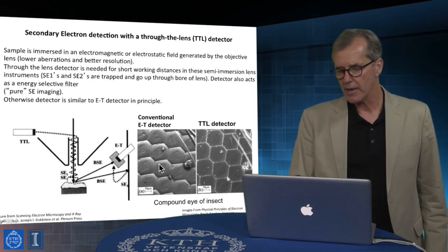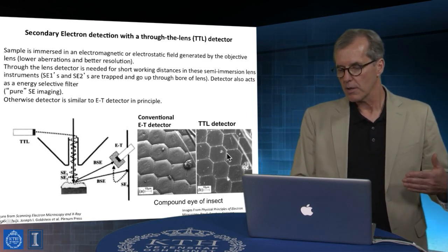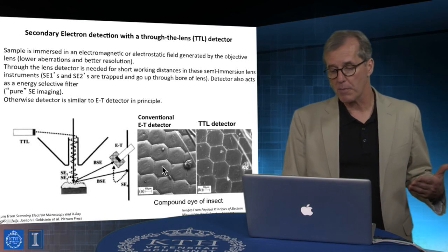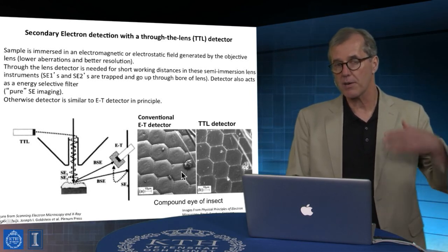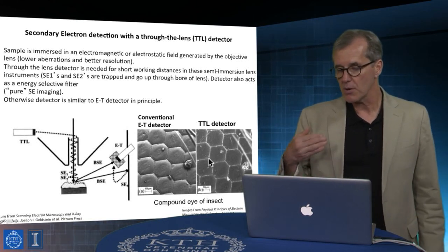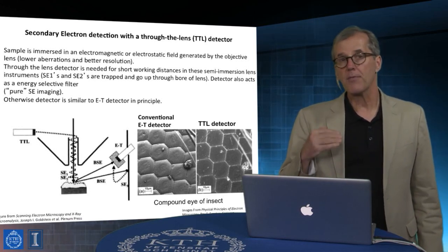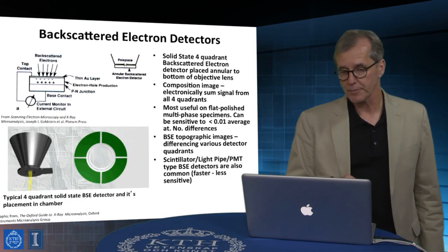And you'll notice that the three-dimensional topology that's present here looks very different there. These are the shadowing effects that we talked about, and other contributions that lead to image contrasts that are not height. So this illustrates how caution has to be exercised when interpreting information as height that may in fact reflect other properties of the measurement.